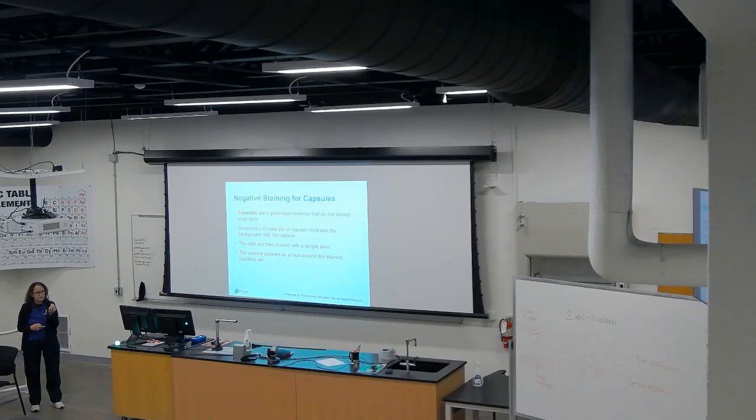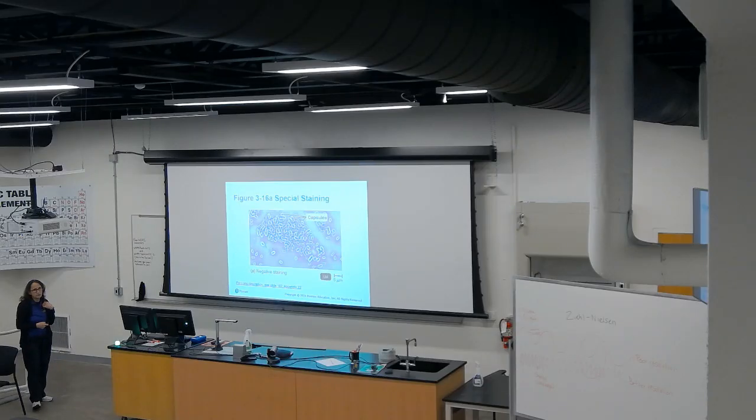In order to tell sometimes what is what, you not only need experience, but you also can have information of what type of sample it is and, perhaps in the case of a clinical sample, what the signs and symptoms of the patient are. In that case, you can guide yourself into what it is.